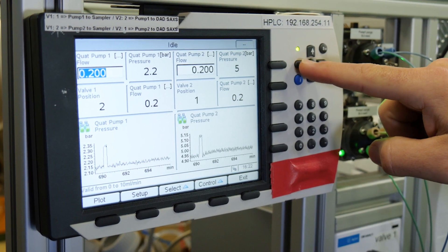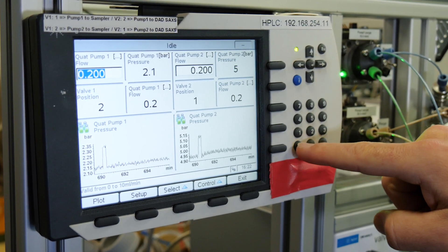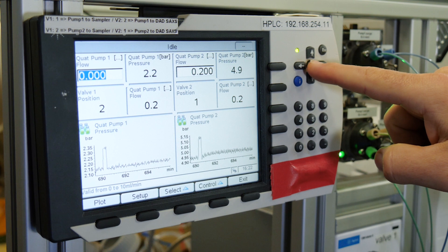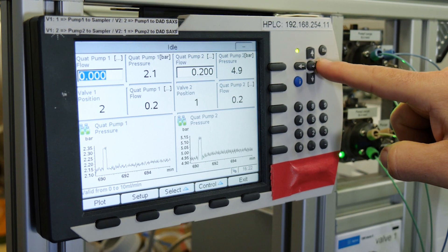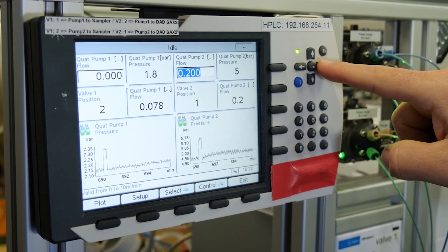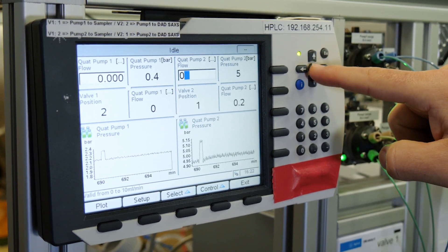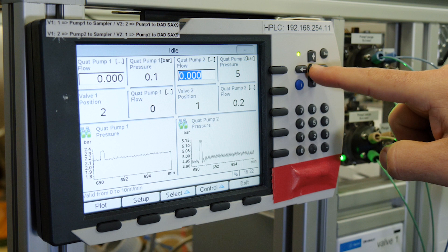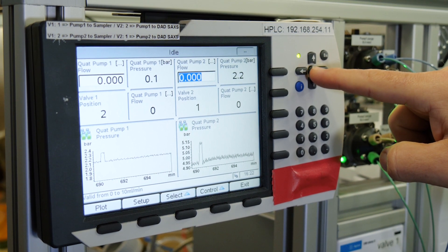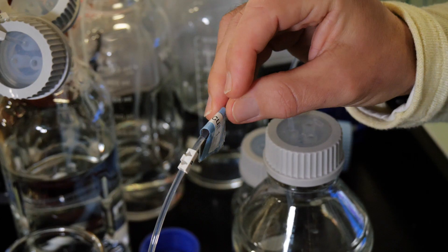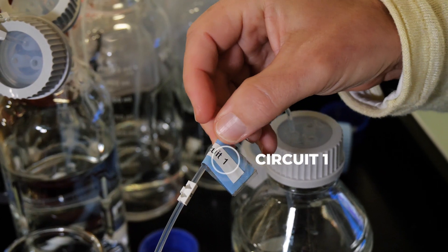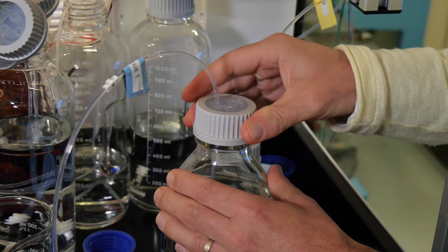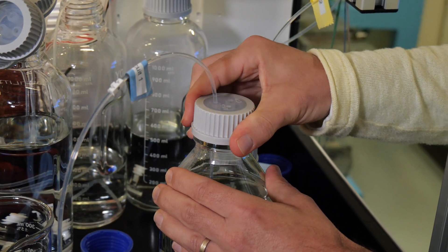Use the arrows to shift from one circuit to another. Do not forget to press the return button to validate the values. Then place the plunger of circuit one with a blue sticker into the buffer chosen for this circuit.